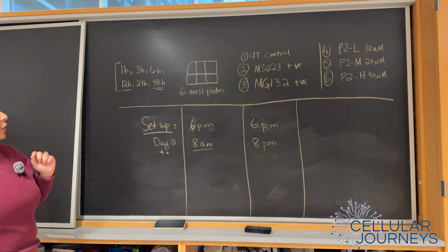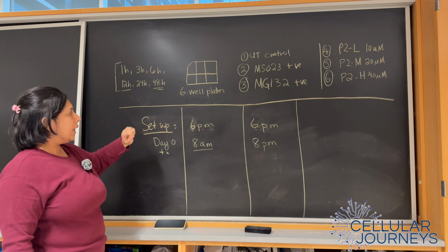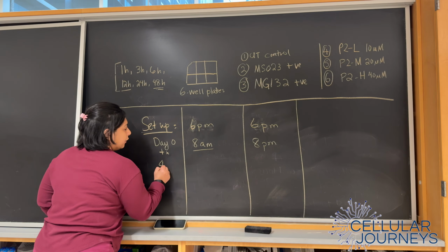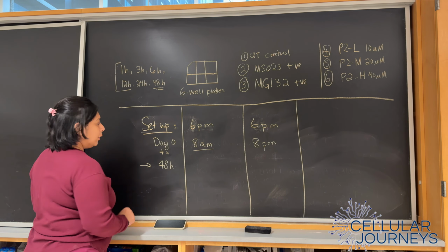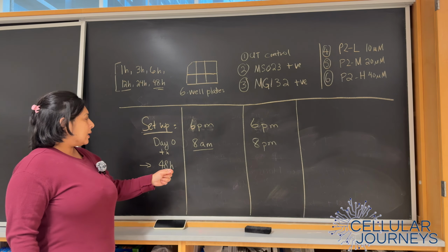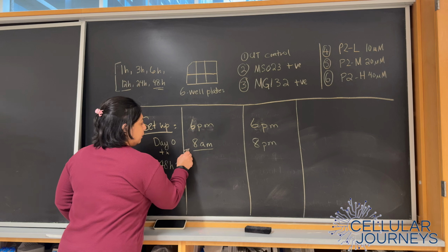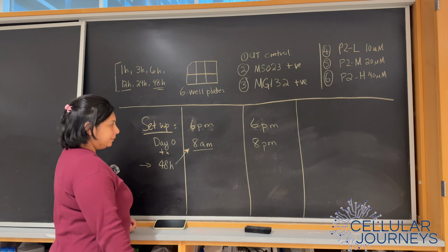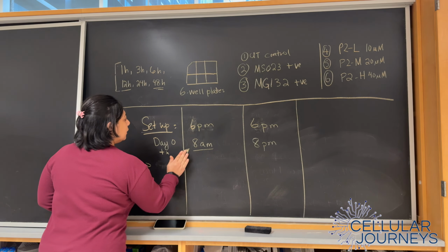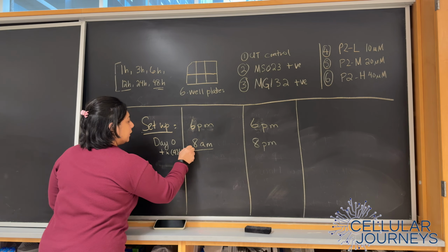In my case, I'm going to stagger the treatment, and I'm going to start off with the latest time point, okay? It's because I want to collect all my samples at the same time. So the first one that I need to treat is the 48-hour one. And so I'm going to go ahead and, for example, treat the cell. So if I start the treatment here, this is going to be my 48-hour time point, yeah? I can start it at 8 a.m. or p.m. Oh, let me just put that. Treatment, day 0 treatment, 48-hour time point.